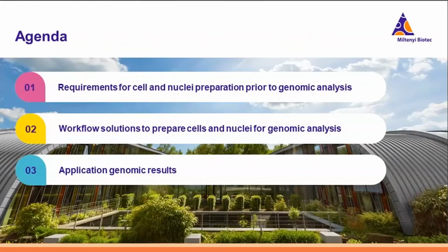As the first point of the agenda for the webinar, I will explain the requirements for cell and nuclei preparation prior to genomic analysis. Next, I will introduce our workflow solutions to prepare cells and nuclei for genomic analysis, and in the last part, I will present some application genomic results from some studies.